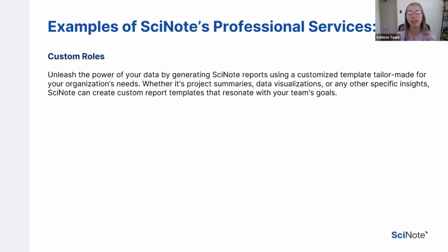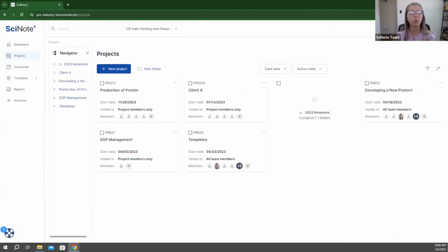Now, if you're going through that and you're finding that it's not following what your team needs, you don't have traditional roles, you have more unique roles for your members, or you have unique naming systems for not only your team, but maybe your project, what we can do is create these roles for you. So let's start by adding a new member to this project here.